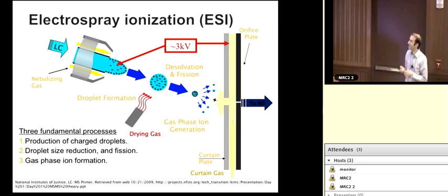And so ideally we would like an analysis with zero matrix effects, where your signal is directly proportional to your concentration and there's no caveats on that. You could just directly use it for calibration. But in the real world, the other things present in your sample or in the environment can affect that relationship between signal and concentration, and we have to manage them.